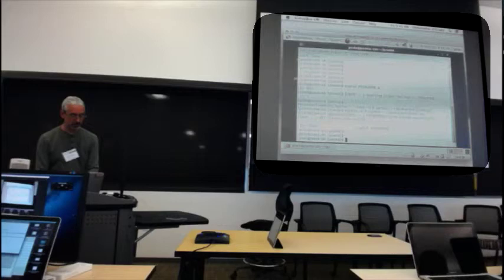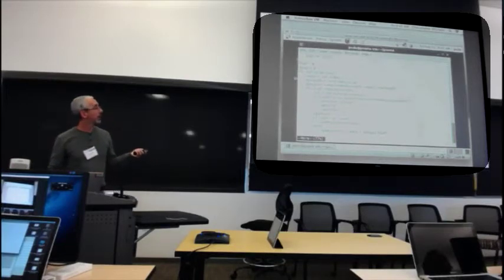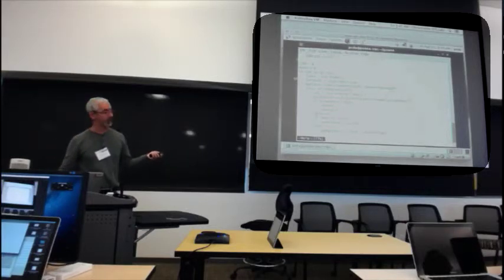Some event counters for bad and good events, because it's one thing you have to keep in mind. LCLS, especially with this multicast, you can drop events because we're multicasting the data. And it turns out that's not a reliable protocol. And so we had to work really hard to make it as reliable as it is. But you can drop events, so you can request an event, or a detector, and it may not be there if the network has dropped it. And that's only when you're running online. Offline, everything's reproducible because you're reading from disk.